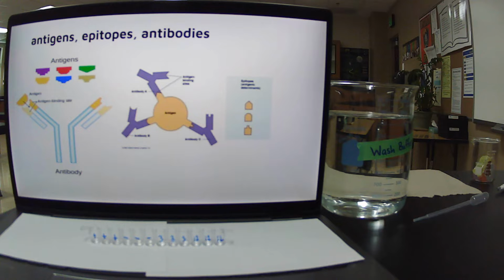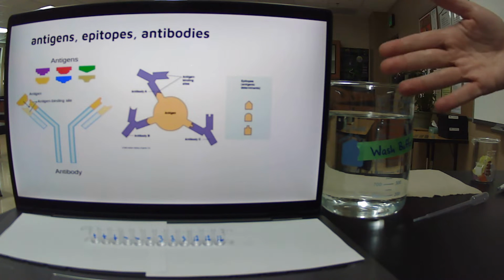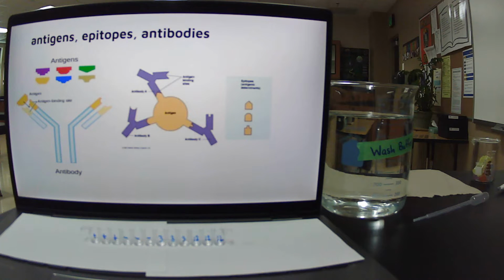All right, everybody, welcome to the ELISA Lab testing day. The video today is going to be a little different because this lab involves a lot of periods where you have to sit and wait for 5 minutes while things are binding onto other molecules. So what you're going to see here, the slides will be obviously on the computer screen in front of you, and we will be talking through little bits of information as we wait.